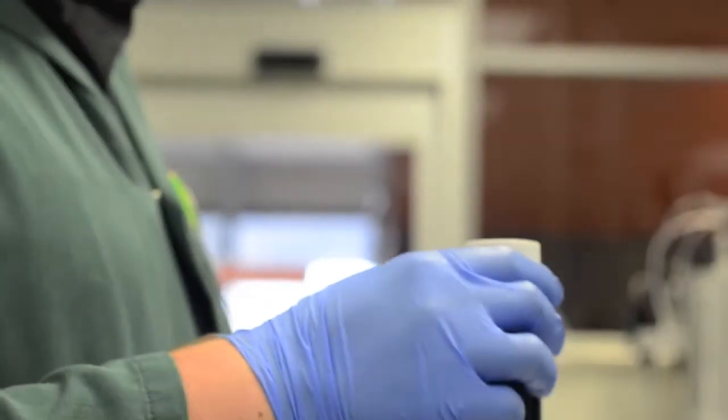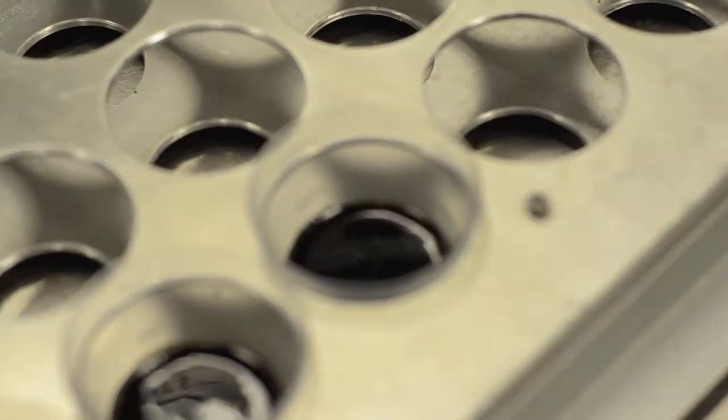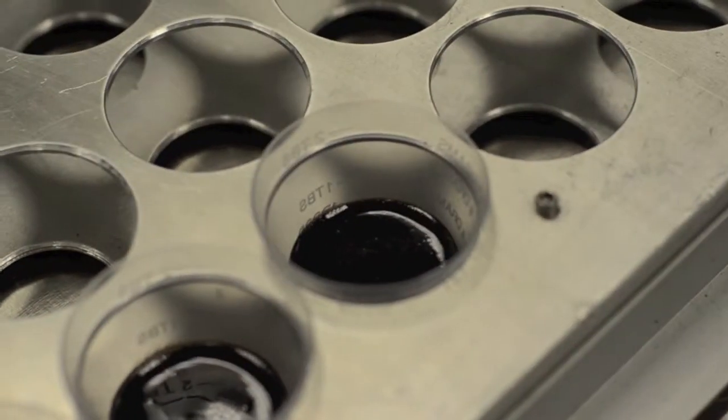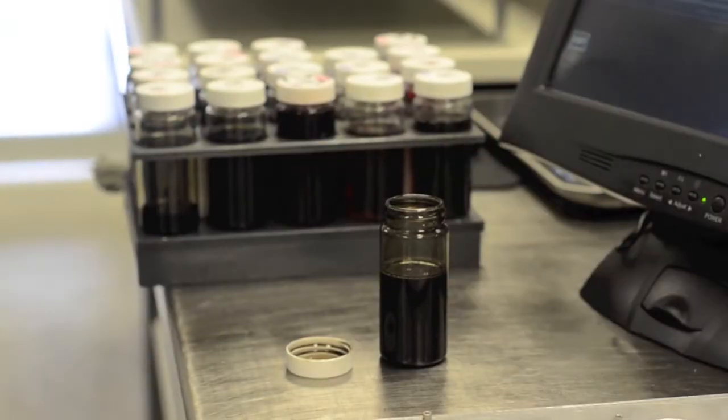For heavily contaminated samples, technicians need only dispense roughly 2 to 10 milliliters of oil, producing dilution ratios between 15 to 1 and 3 to 1, ensuring that even heavily contaminated samples receive accurate particle count data.